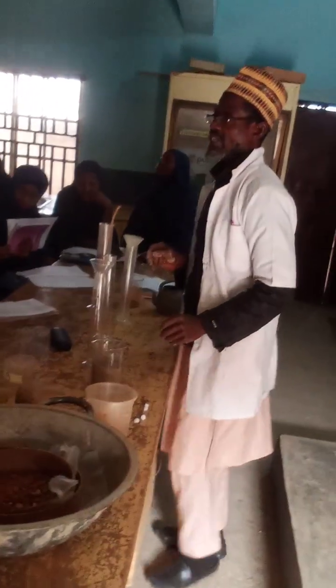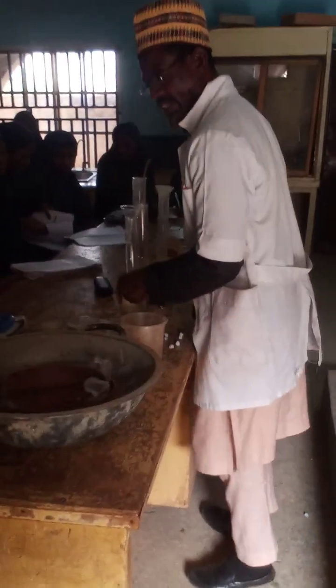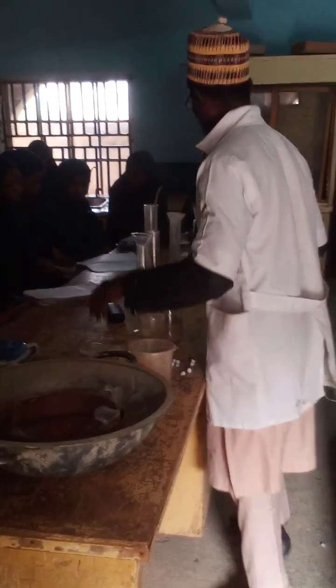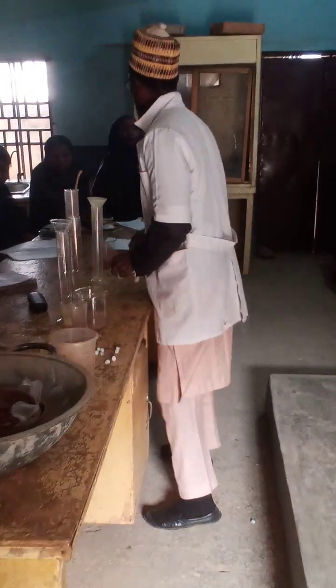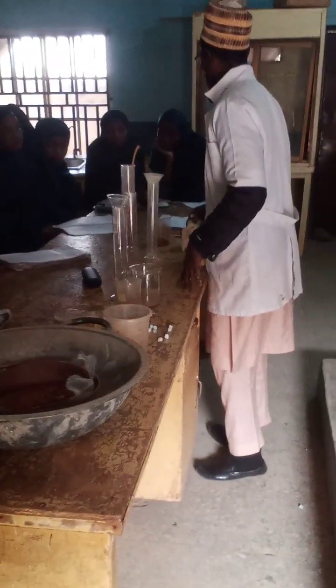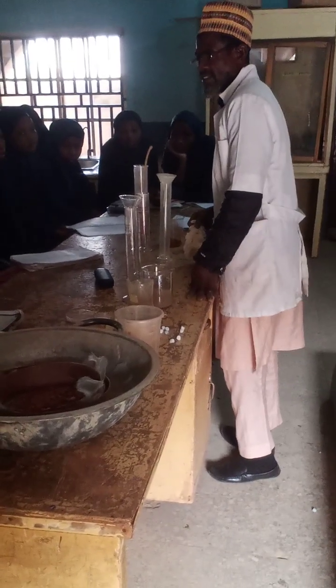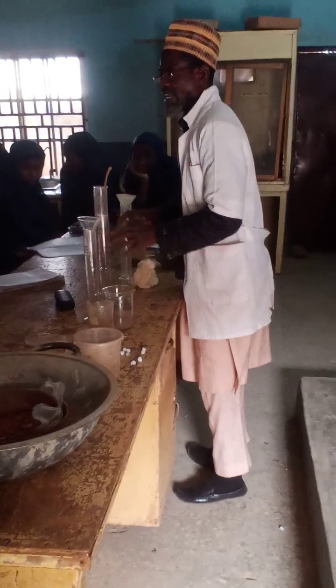So this time, that is experimental. This one is to determine the porosity or drainage of various soil samples. Normally by porosity, we mean drainage, permeability, retentivity. Look at it. How different soil types can retain water. That's what is meant by porosity.